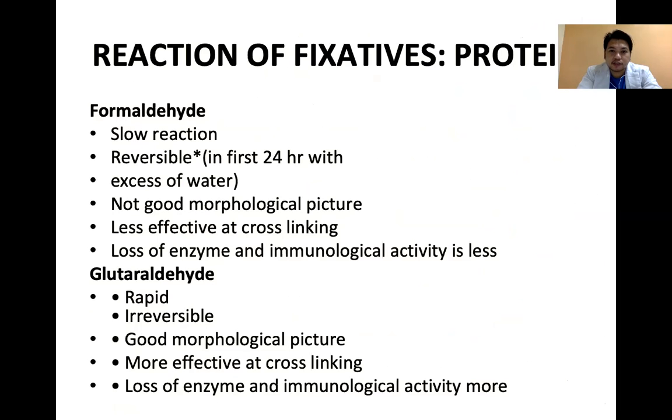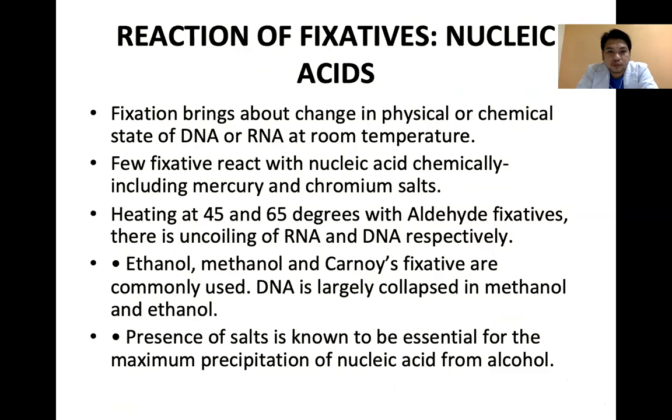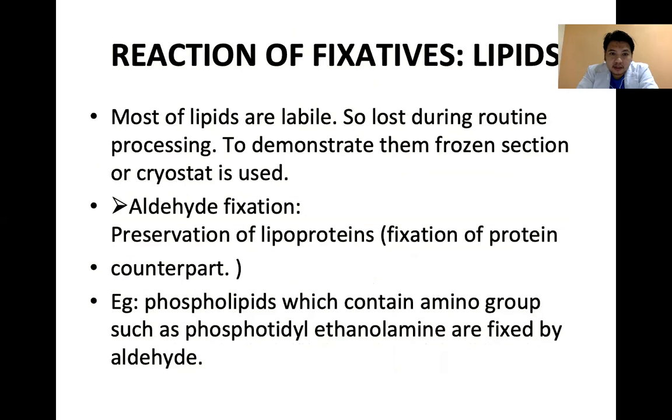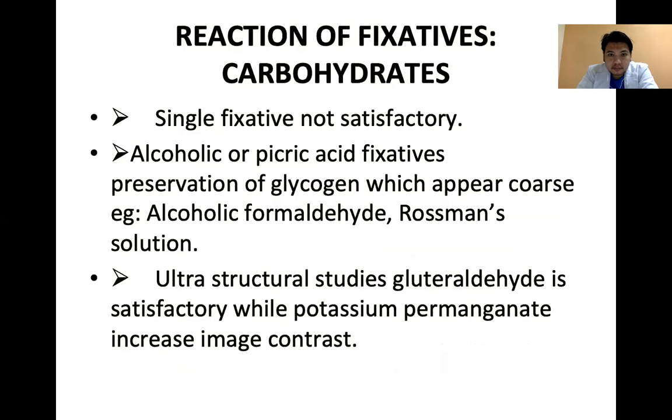So these are the reactions of fixatives to protein. These are the reactions of fixatives to nucleic acids, our DNA and RNA. And the reactions of fixatives to lipids. For carbohydrates, we have alcoholic or picric acid fixatives.